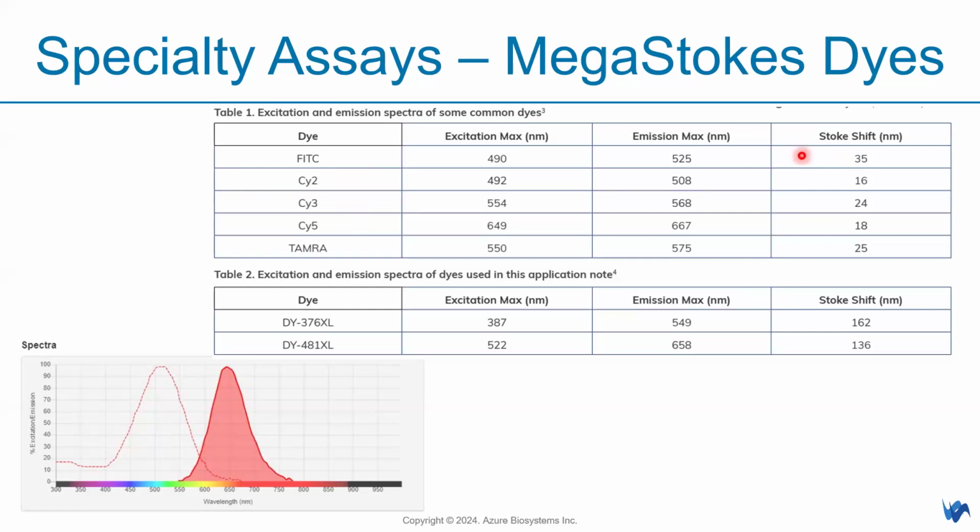So this is standard of what we have in fluorescent microscopes, in the normal fluorescent laser scanning system and so on and so forth. But there is more development in designing and looking for dyes that have larger Stokes shift. So you can see here there are 2 dyes we listed here. The Stokes shift is around 130 and 162 nanometer wavelength.